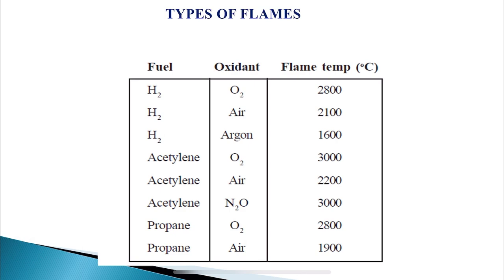In the same way, if calcium is present, it is going to emit the absorbed radiation at 622 nanometer and the flame color will be orange. And suppose if lithium is present in the given sample, the emitted wavelength of lithium is 670 nanometer and the color of the flame will look red. So this is how all the alkali metals have their own characteristic wavelength and also express their presence by their own characteristic colors.